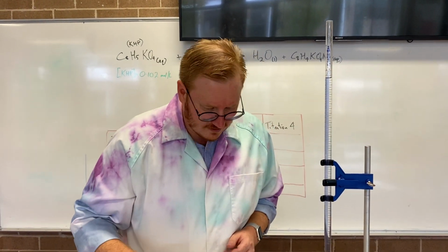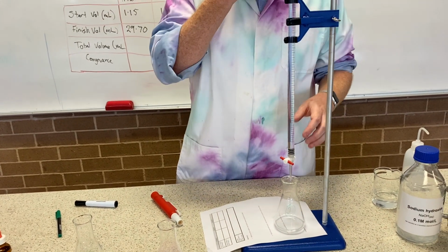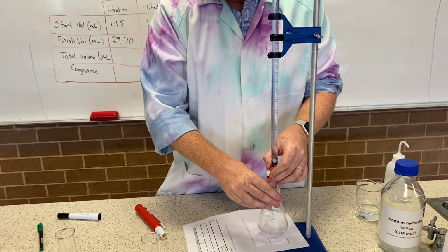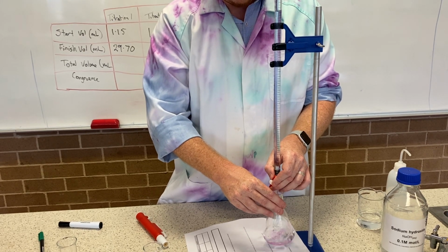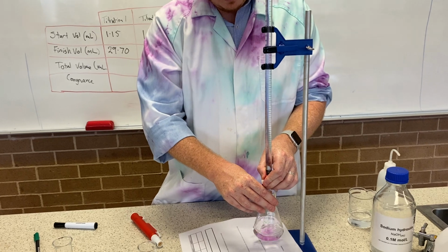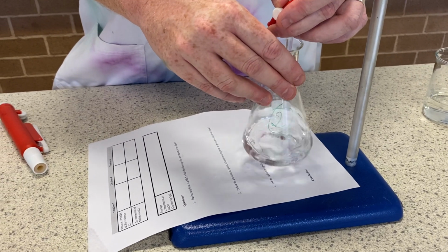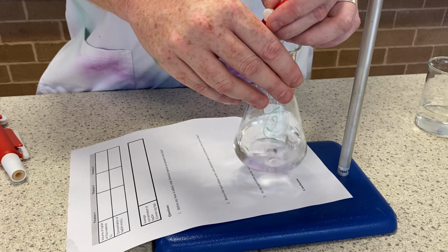Put it in my titration 2 for the start. I'll keep these in the same order. Number 2. I've got my indicator in there. Don't forget to do that. All right, I'm ready to roll. Okay, zipping down quickly. I know it's going to be roughly about 28, 29. So I'm slowing down as I'm getting down towards there. Drop by drop. So I'm about 27.